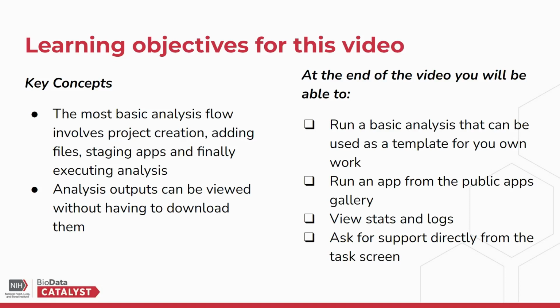At the end of the video, you will be able to run a basic analysis that can be used as a template for your own work. You'll be able to run an app from the public apps gallery, view the stats and logs of a running or completed analysis, and ask for support directly from the task screen without even having to send an email.